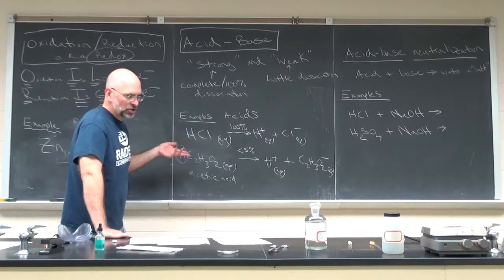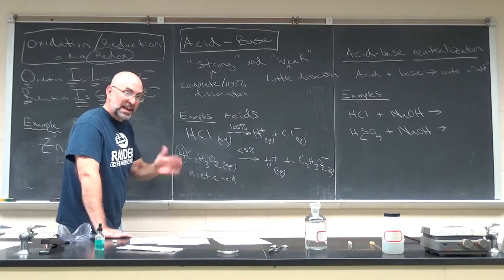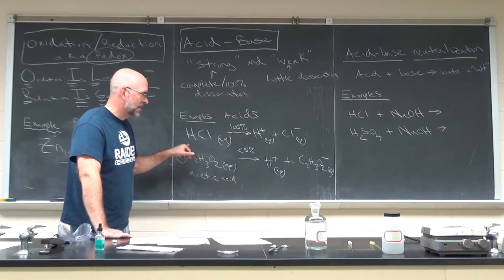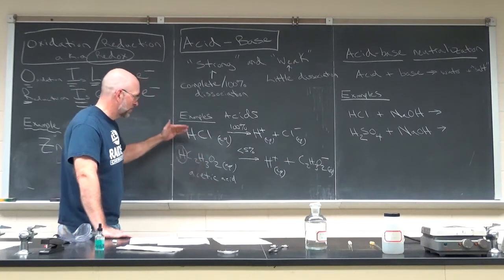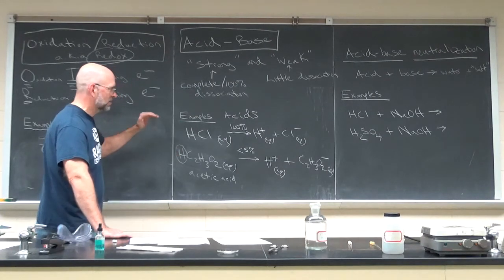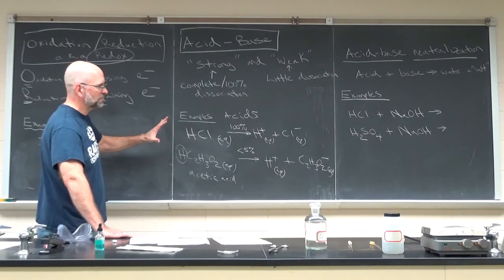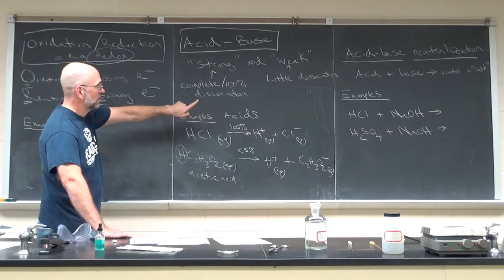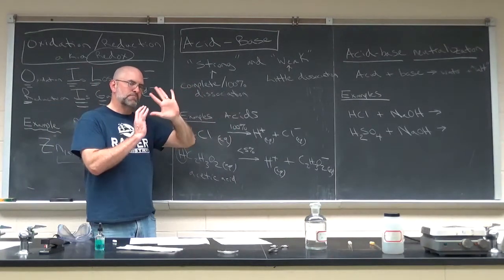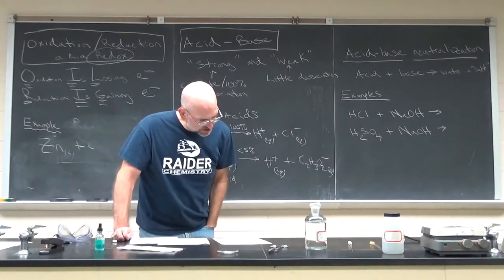So one of the things you're going to do is you're going to take the pH of a set of acids and bases that have the same concentration to control that variable, and measure the pH and then identify them as strong versus weak. So you'll measure the pH of HCl, you'll measure the pH of acetic acid, again, same concentration, and then explain what you observe with the pH paper based on these definitions. Okay, that's fine. I didn't do the same thing for bases, but I'm going to leave something up to you here, so you have to do that yourself. And that's procedure number 2.